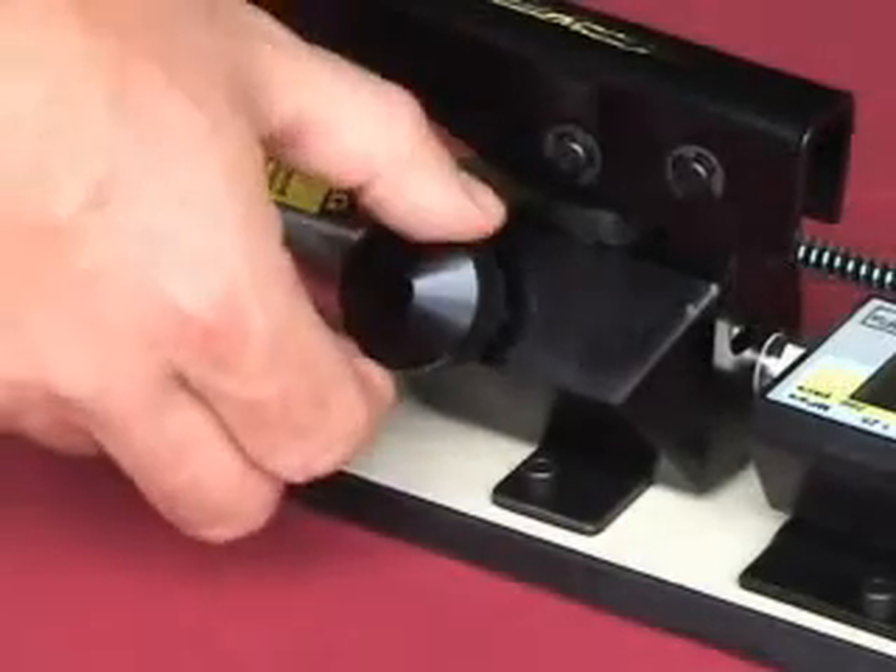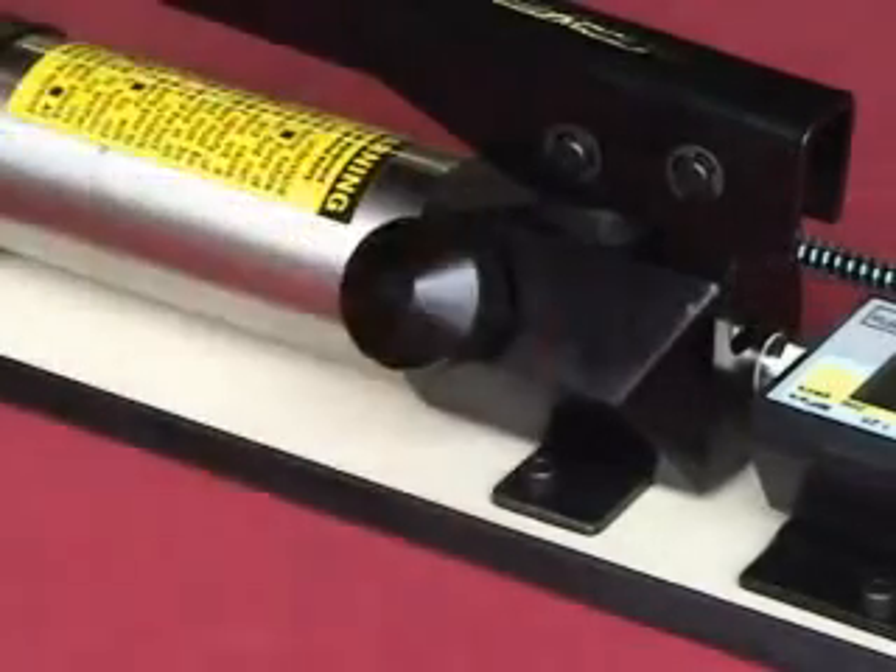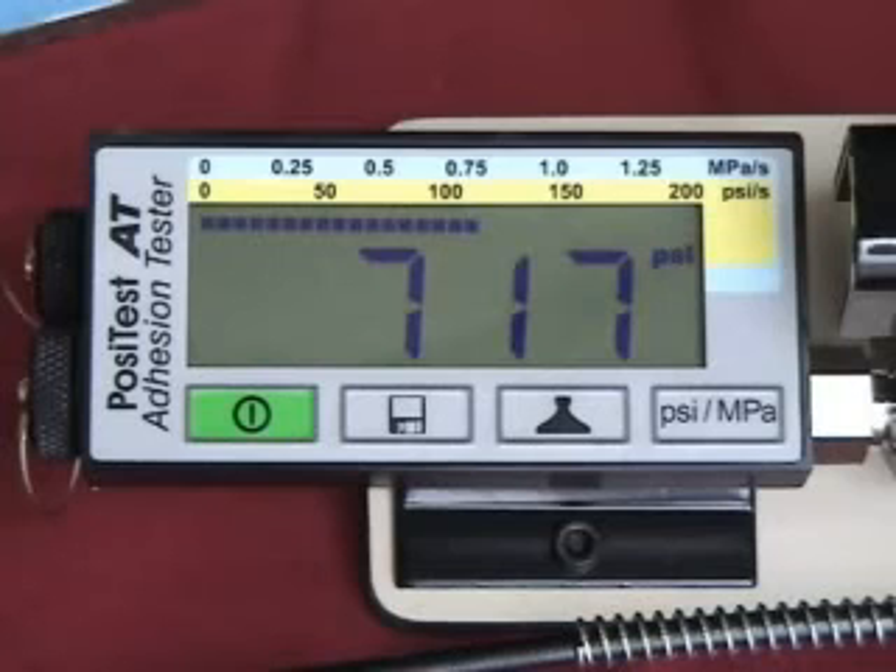After the pull-off occurs, open the pressure relief valve. The display holds the maximum pull-off pressure value. Since calculations are made automatically by the tester, there is no need for conversion charts for different dolly sizes.